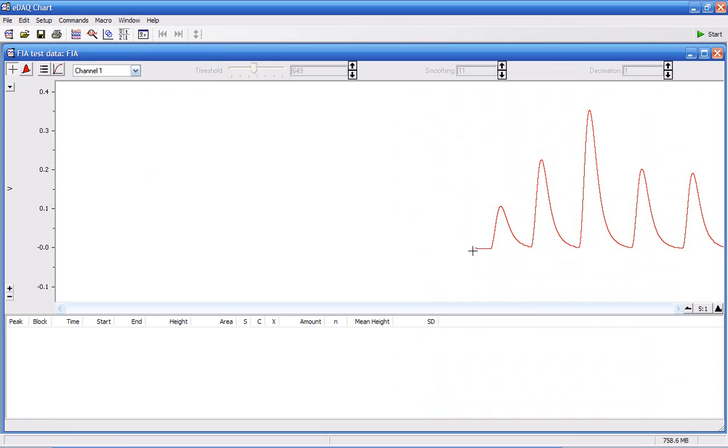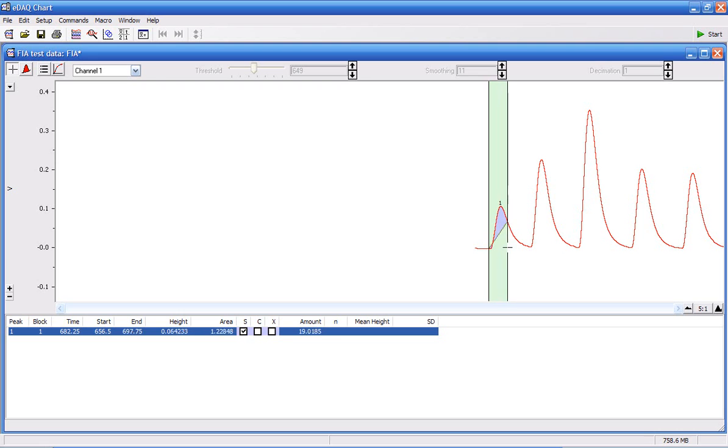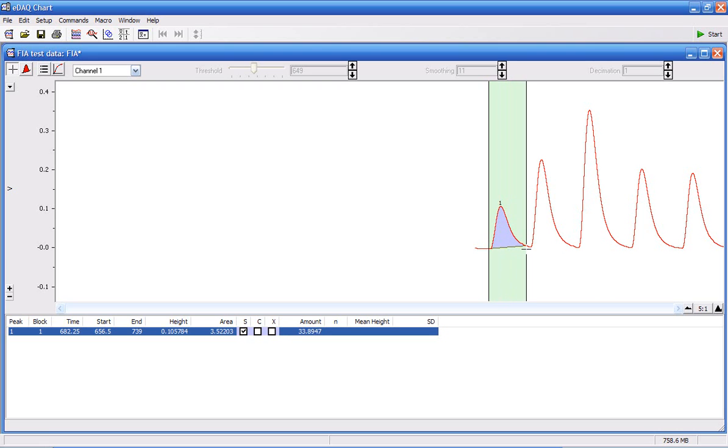To add a peak, I simply move the cursor to the start of the peak, press and hold the mouse button, and move the mouse to the right to the end of the peak. Now the software has integrated that peak and calculated the height of the peak and the area.